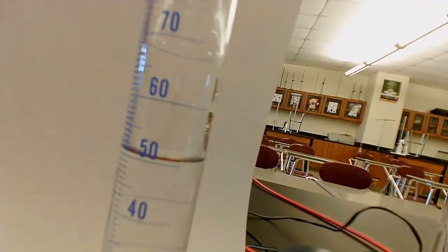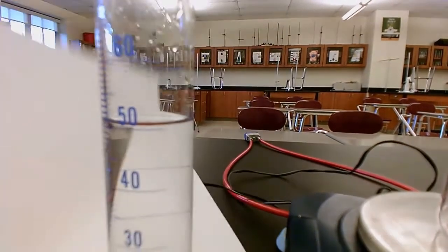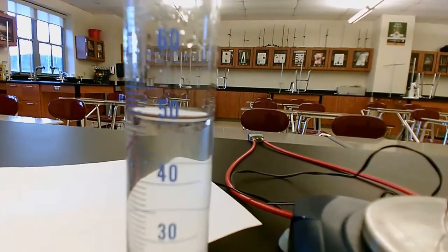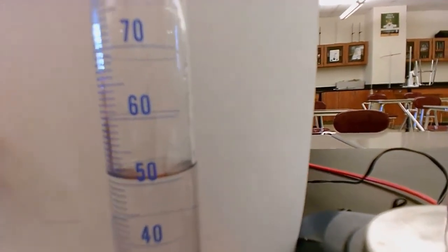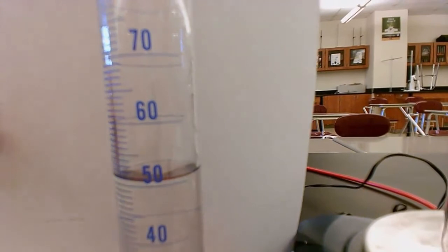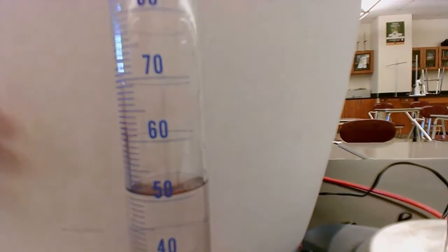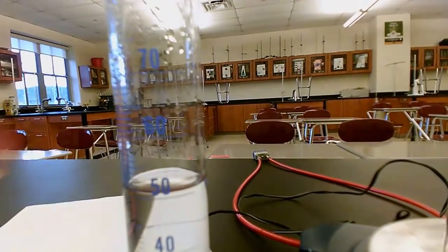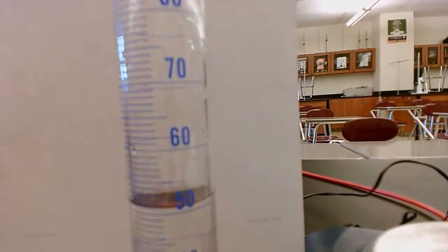All right. So that is my reading. It's hard to see, but you have a little bubble there. I'm going to turn it a little bit so you can see the graduations. If you notice, this is a 100 milliliter graduated cylinder, and the graduations are by ones. So you're going to record your volume from the bottom of the meniscus. I will not tell you what that volume is. You have to read.